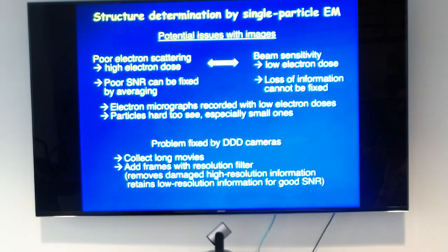The problem is at the moment the electron beam hits your specimen, you deposit a lot of energy on your specimen, you have energy that needs to dissipate, and so the specimen has to start moving. It always starts moving. Because we only had one shot at it, all our images were blurred just because of the initial hit. There was nothing we could do about it.